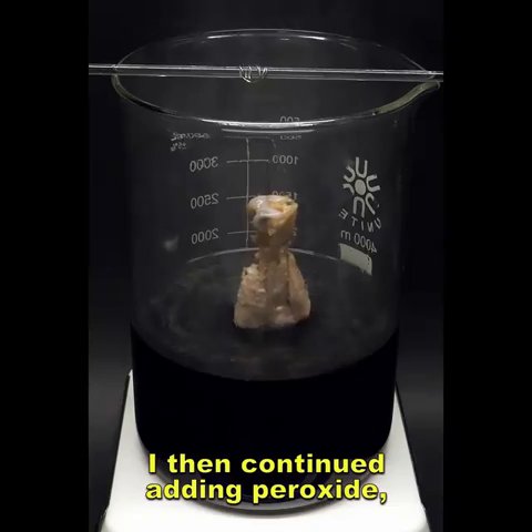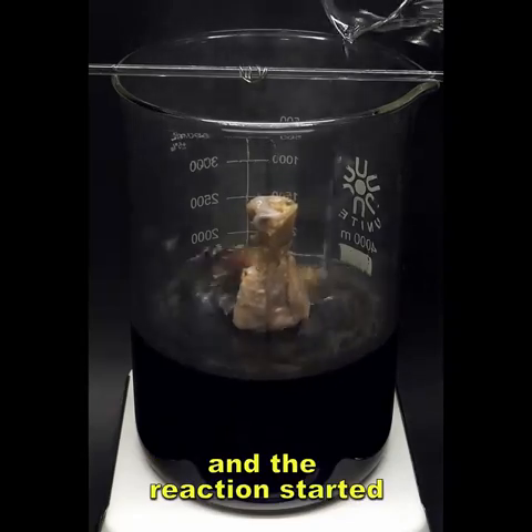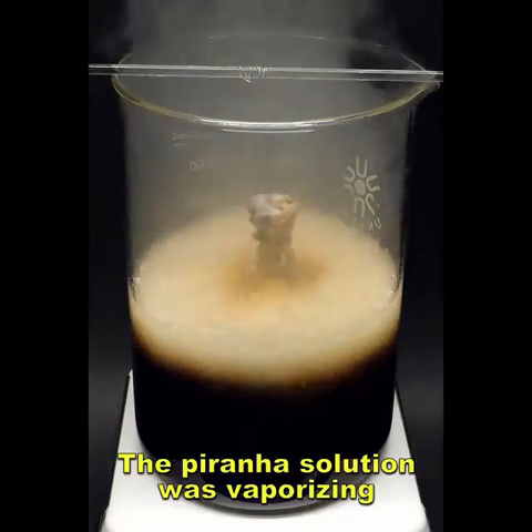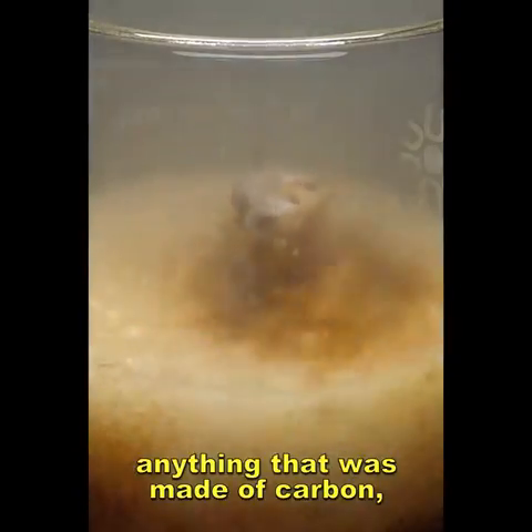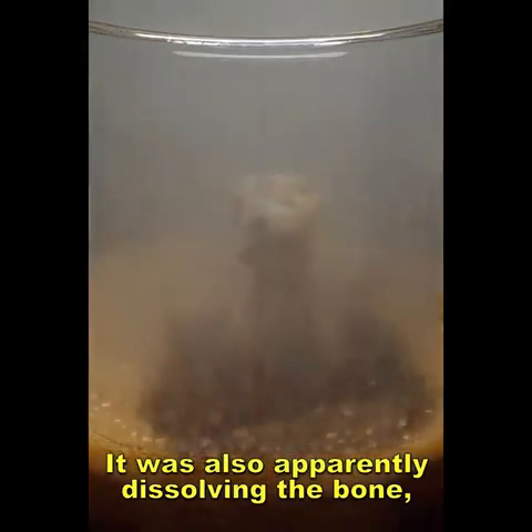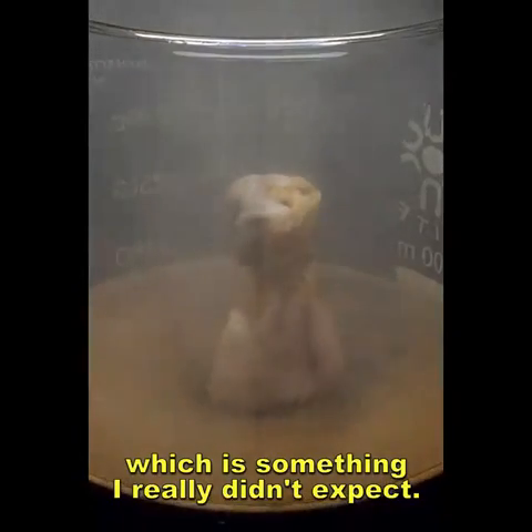I then continued adding peroxide, and the reaction started getting violent again. The piranha solution was vaporizing anything made of carbon and turning it into CO2 gas. It was also apparently dissolving the bone, which is something I really didn't expect.